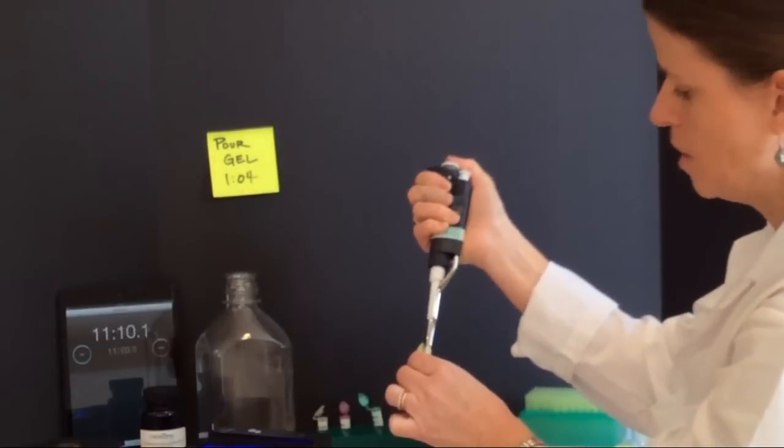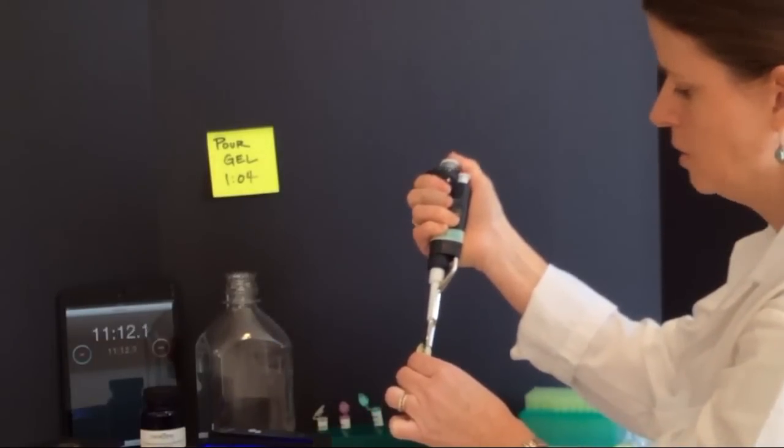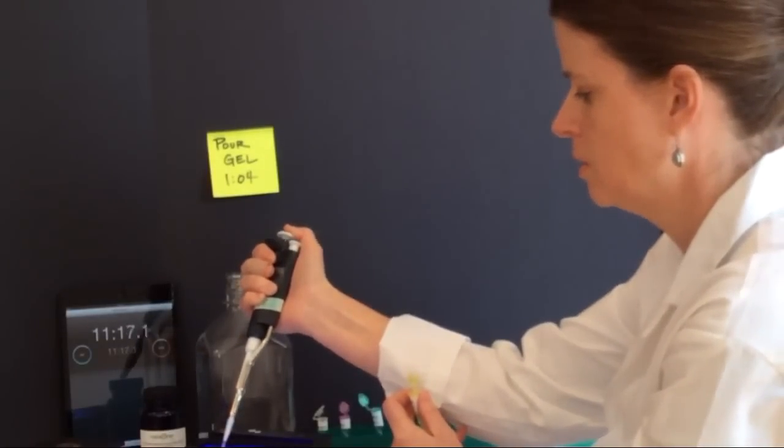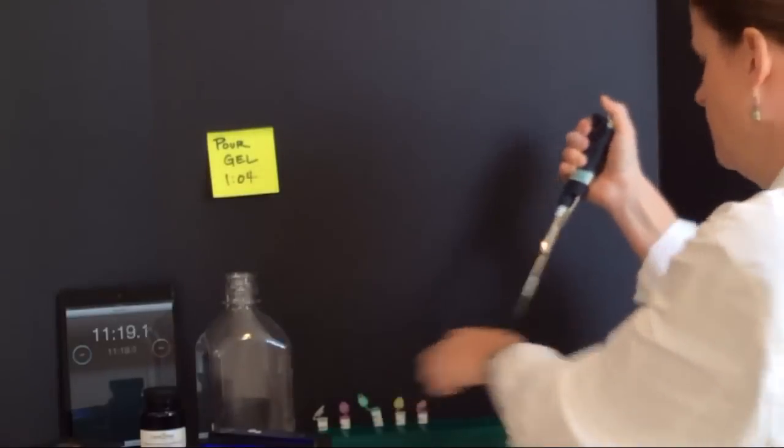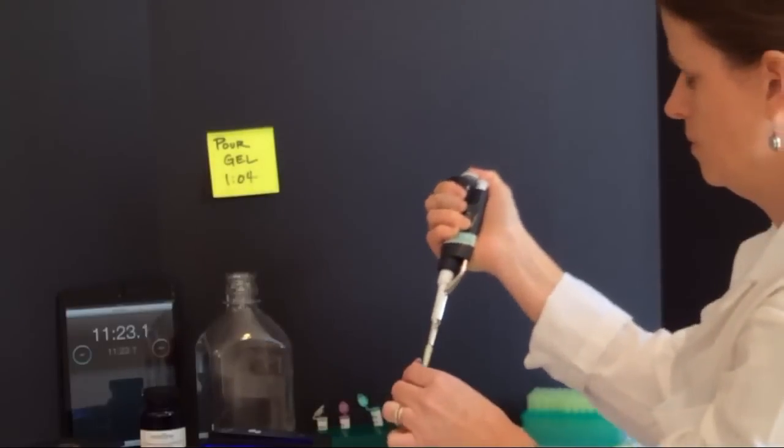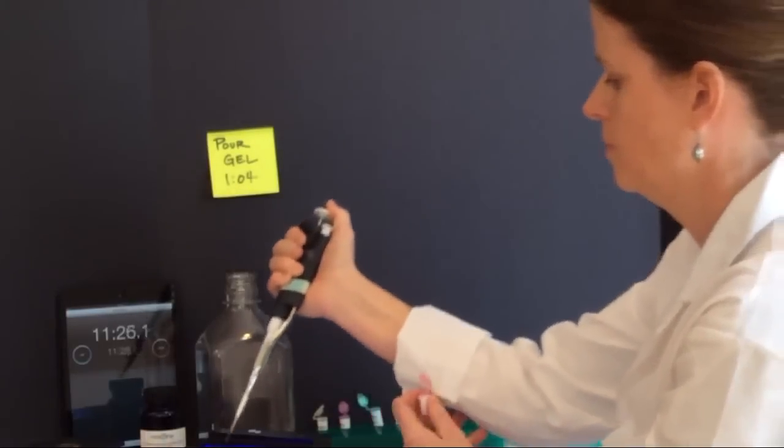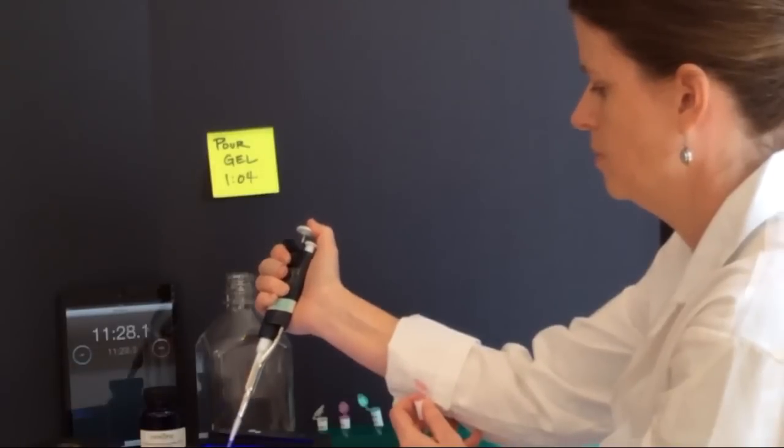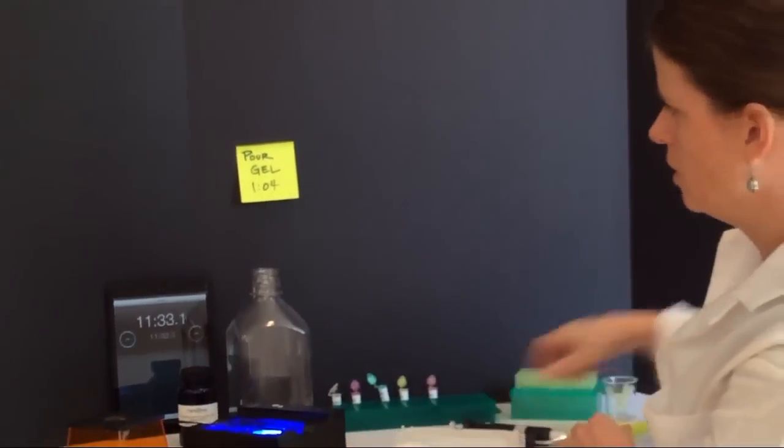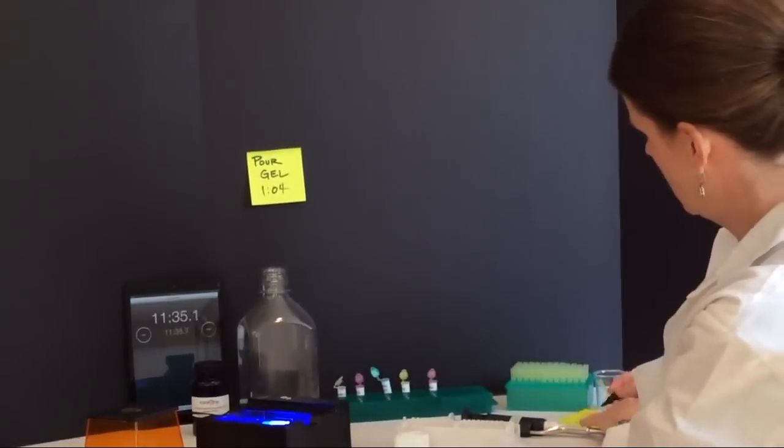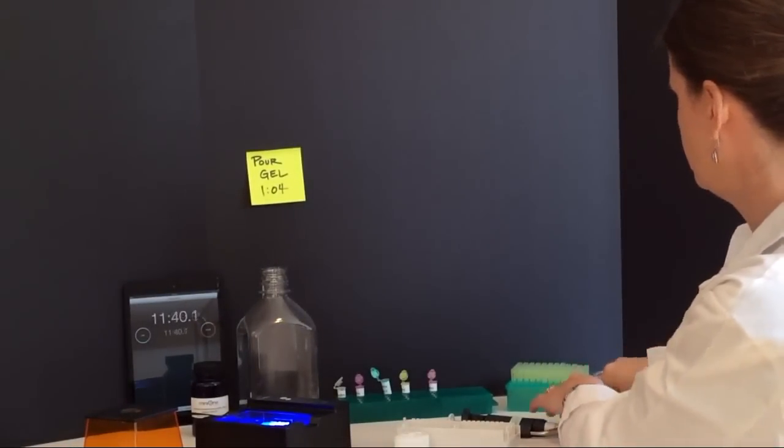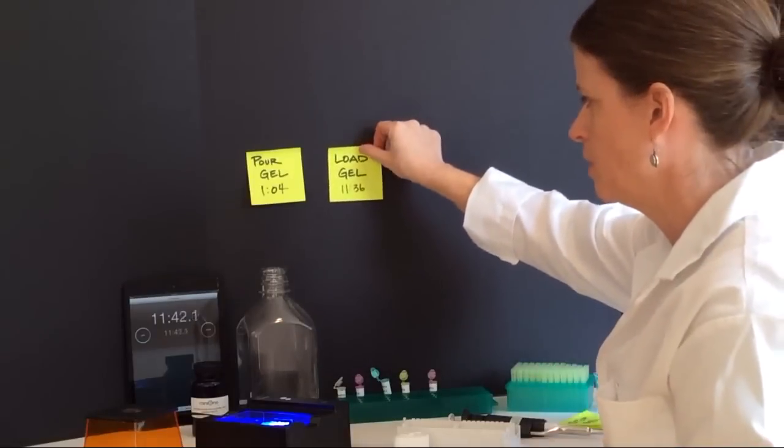Once I've loaded all of my samples, I'll be able to run my gel. This gel will run for approximately 20 to 25 minutes. I'm going to make note of our time here. So we're at 11 minutes and 36 seconds, and I've already poured and loaded my gel.